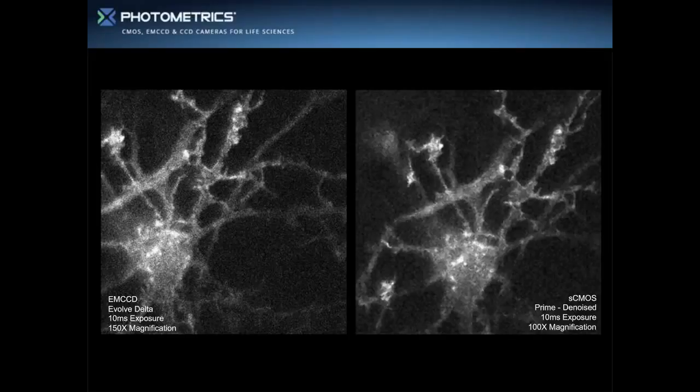Let me know if this is answerable here. Are the signal-to-noise ratio versus photon flux curves corrected for pixel size? Yes, pixel size is taken into account.